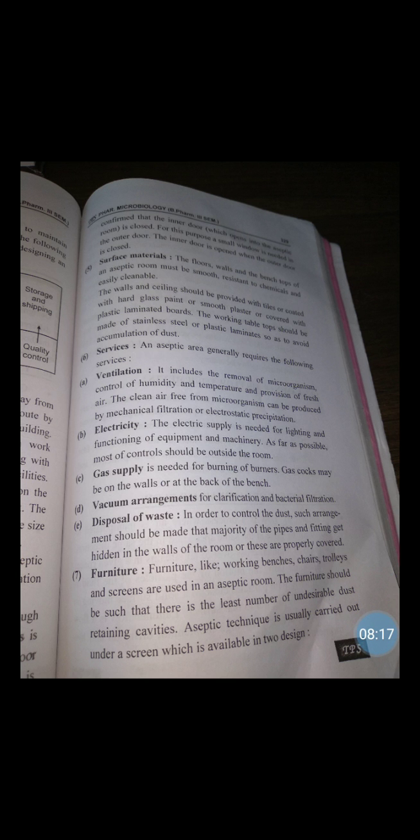First, ventilation. It includes the removal of microorganisms, control of humidity, control of temperature, and the provision of fresh air.